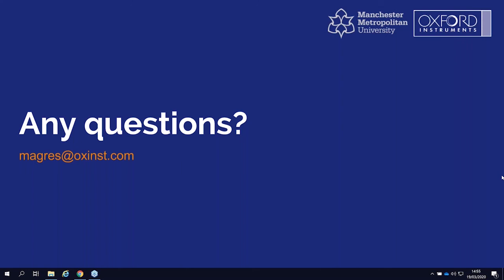Thanks very much. So yes, Chris, do please drop that email a line, and they should be able to help you out with anything in particular you're looking at. Let's move away from the actual setup itself a bit. I mentioned earlier the current crop of undergraduates, and of course we promptly received a question from a current undergraduate. He's saying that lithium NMR is quite new, and does it require a particular internal standard, or is there any other way to quantify it?